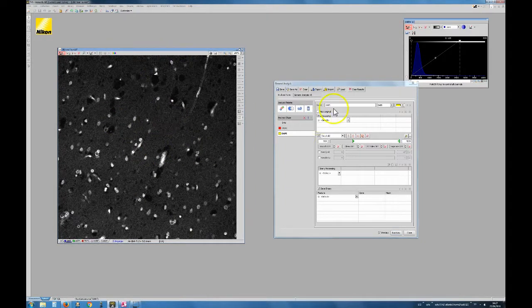And what we're going to do is use this area that will help us run the segmentation properly. Pre-processing is something we do to the image before we make the mask, and this is meant to help make the mask. So we're going to do a little bit of pre-processing here. As you can see, we have lots of different things that we can do in the pre-processing, like removing the background, increasing the contrast, etc. There's lots of stuff, but right now one thing that works quite well for nuclei is under denoising, median.